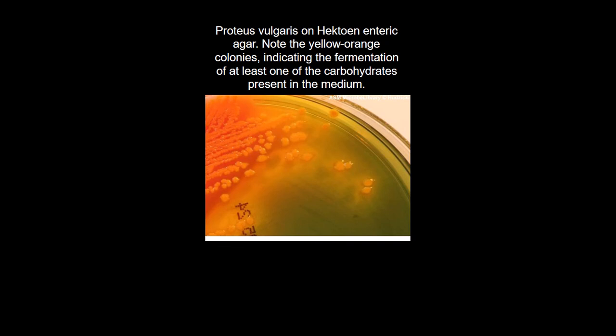So the non-lactose fermenters are the ones that we are concerned about, while the others that are lactose fermenters, whether they are yellow or any other color, we have to ignore, as they are not what we are looking for: the pathogens that are associated with infection of the gastrointestinal tract.